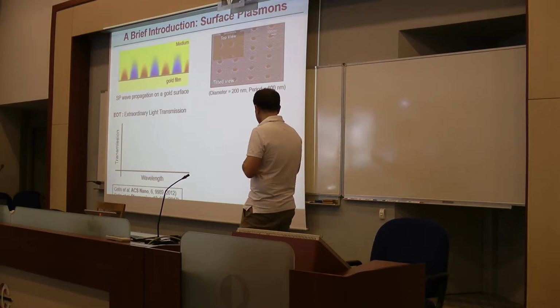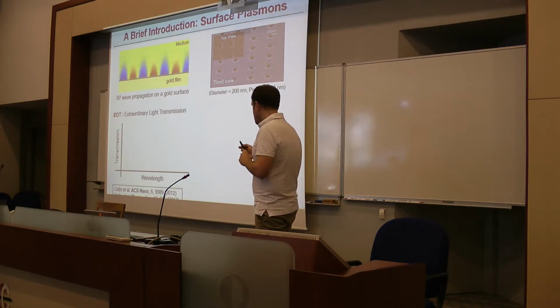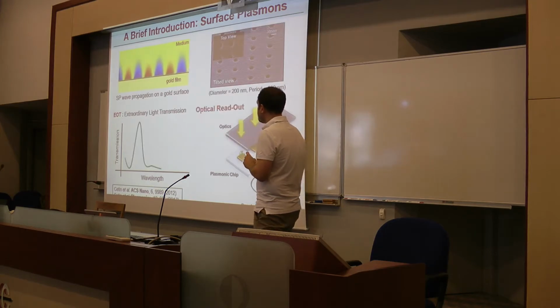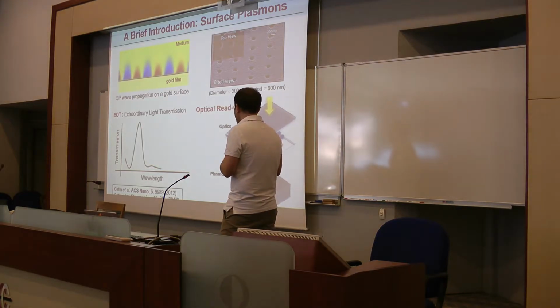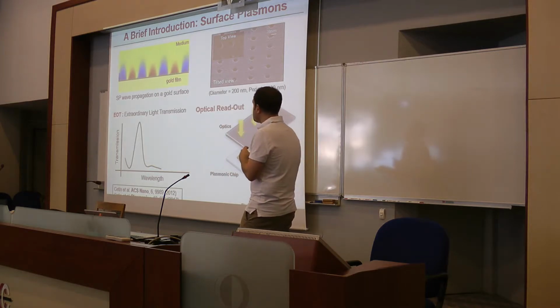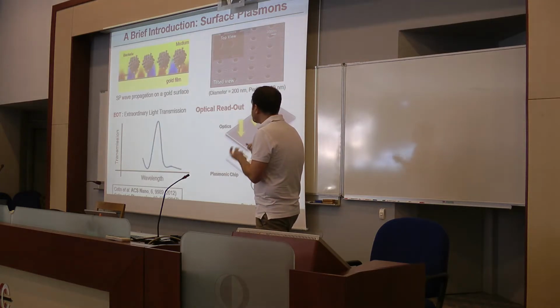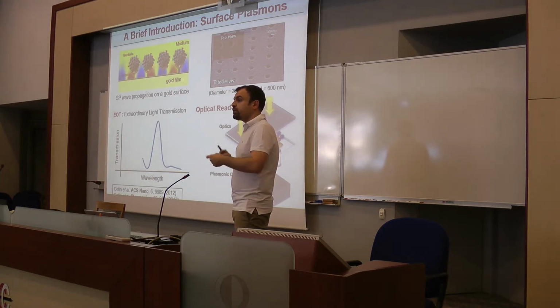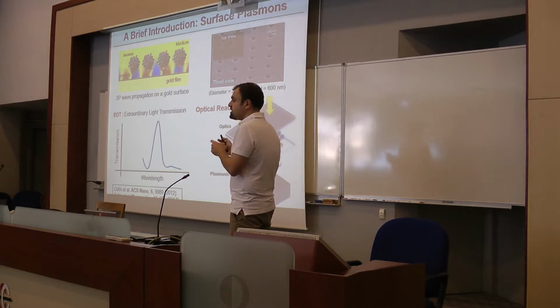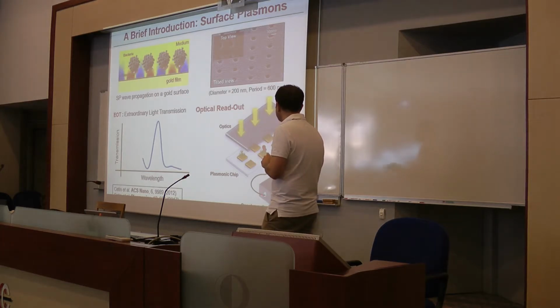In our group, we are mainly using periodic nano arrays fabricated along a thin gold film. These structures work like a filter that allows light transmission in a certain wavelength range and filters out the rest. And since this light transmission is associated with strong light localization at the nanometer scale, if a material or a biological target, such as a bacteria here, sticks on the gold surface, the electromagnetic properties of light change. You see this change in the electromagnetic profile as a spectral shift in the visible range. And then you read this spectral shift with, for example, a classical spectrometer.